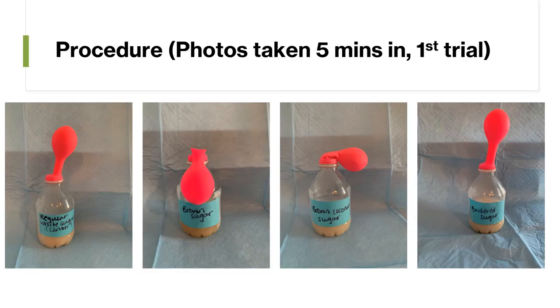These photos were taken about five minutes into my first trial. I only have pictures for my first and third trials, but you can see the reaction happening at different speeds for each sugar. Five minutes in, I already had the balloon standing up full of gas from the regular white sugar and the powdered sugar. I was still waiting on the brown sugar and the coconut brown sugar to stand up — you can see them starting to bulge and fill up but not standing all the way.